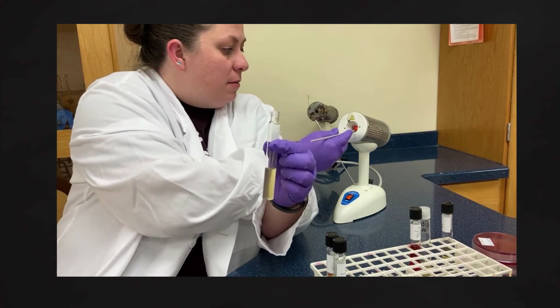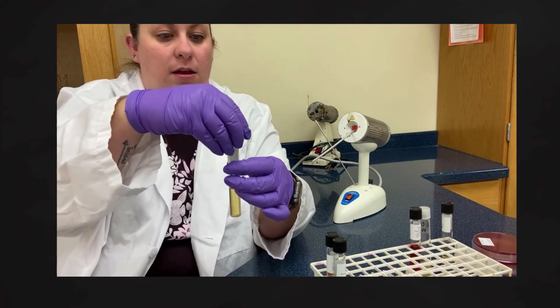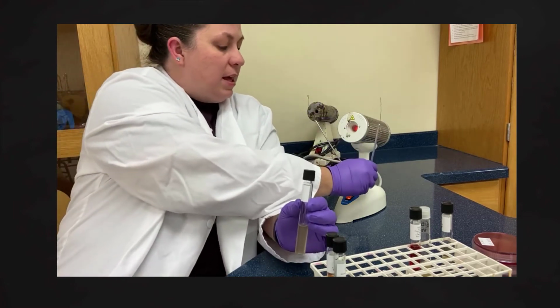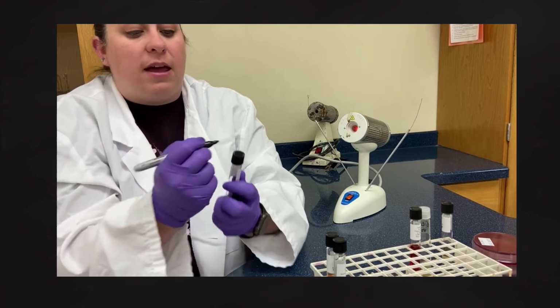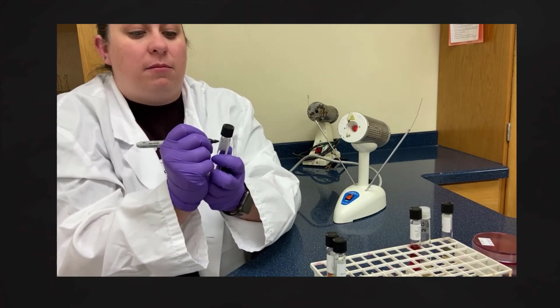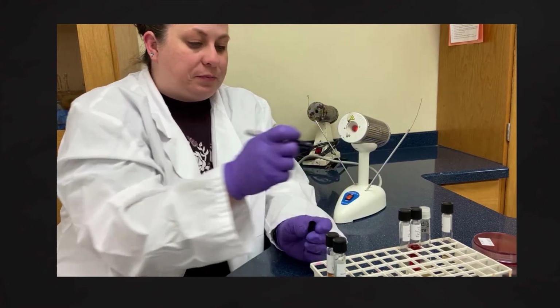And then I'm going to go through the process of sterilizing my needle. Okay, again, putting the lid on, taking it half a screw back so that gas, if it is produced, can be released. Labeling my tube.